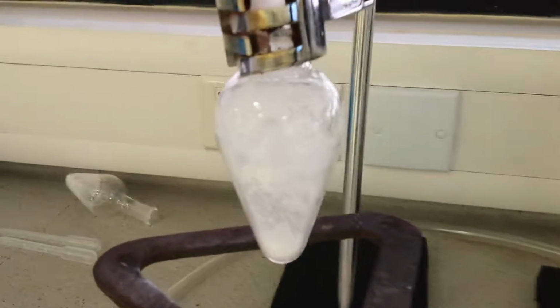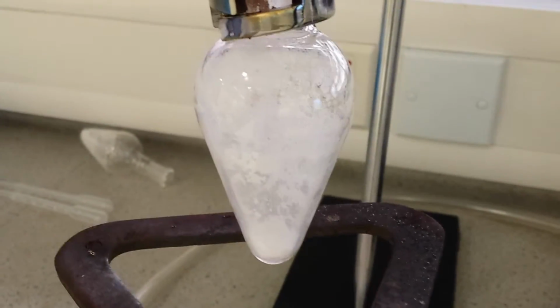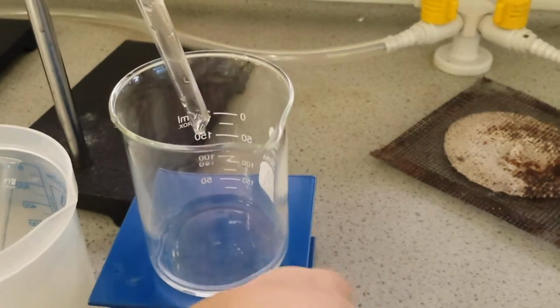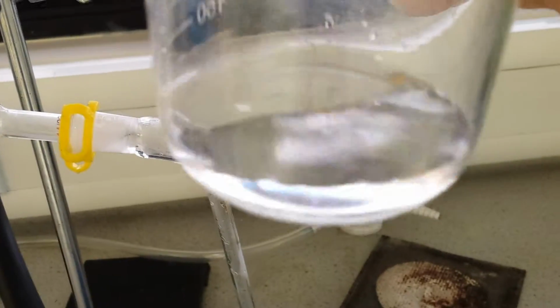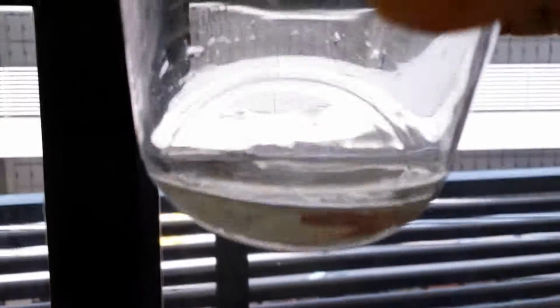Now look at that. That is what is left after we boil out the water. Let me just bring this down. And this is the water that evaporated and passed through the condensing tube, and this is what you have left. There you go.